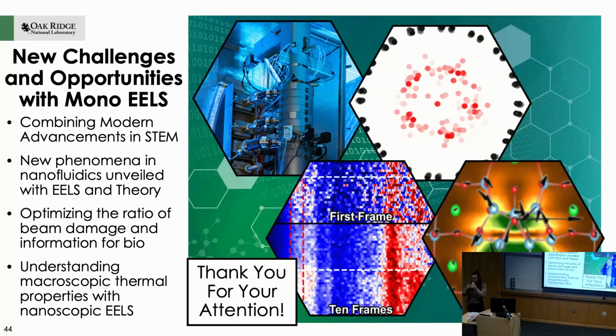Can I just ask about these long acquisition times that you talked about, with your cryocooler or your cryogenics? So how long does each one of those spectra take to acquire? So the spectra I showed for the carbon nanotubes will be about 1.5 minutes per spectrum.